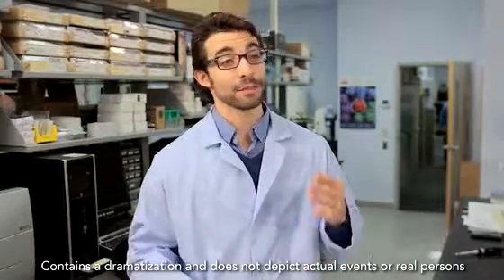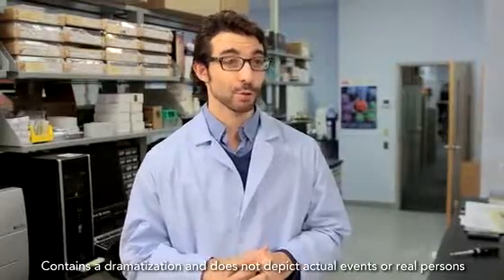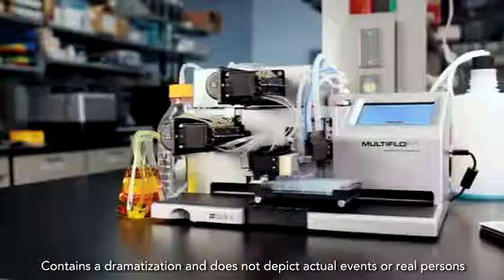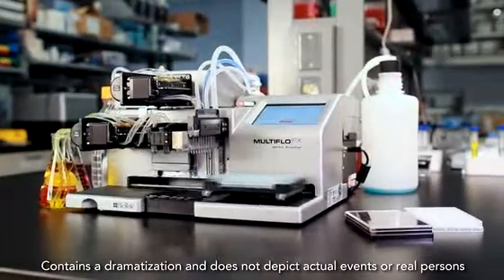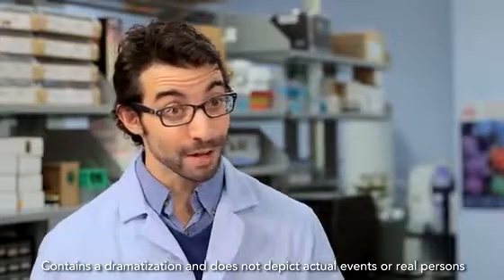One Multiflow FX in the lab can take the place of four dispensers, so we're saving bench space and money. And the fact that we can wash and dispense in everything from 6 to 384 well microplates in this one instrument is amazing.